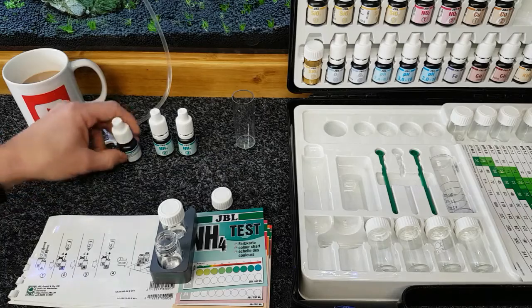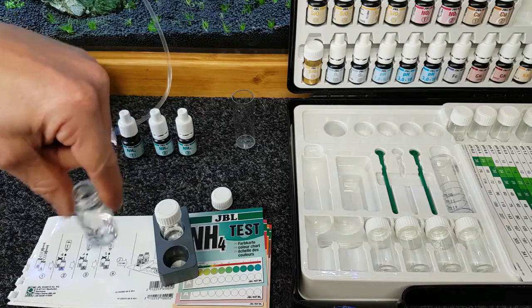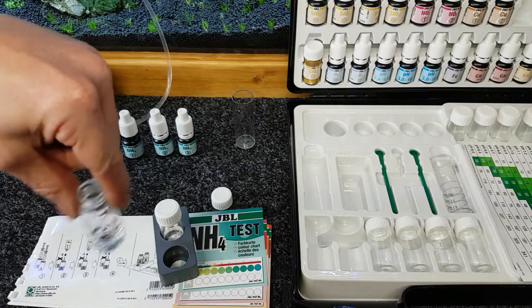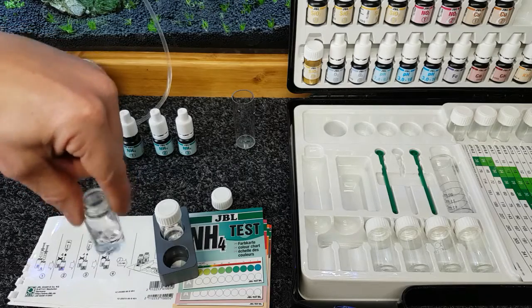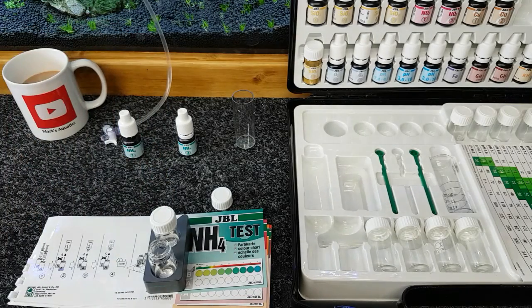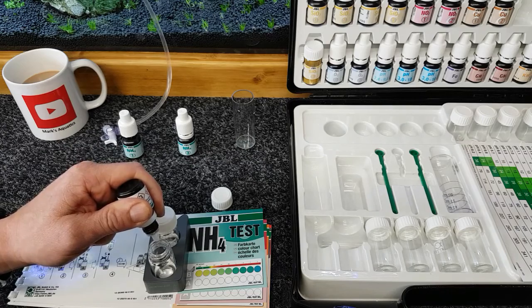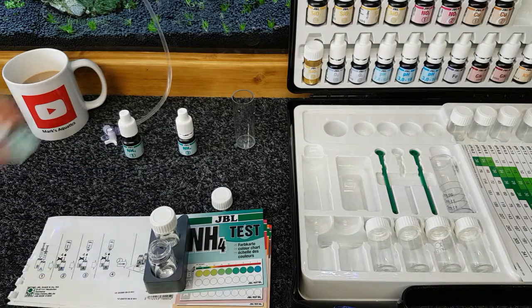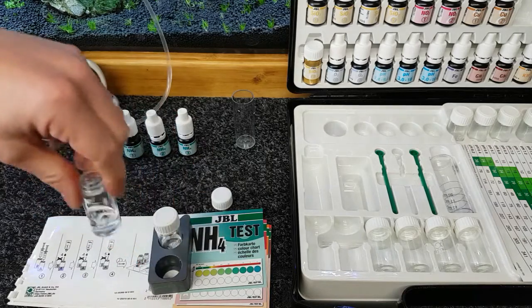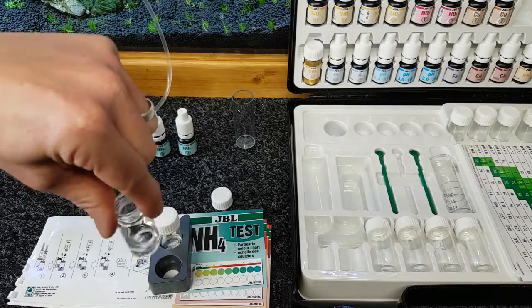Don't get this stuff on your hands, guys, okay? I'd wear gloves if you've got them. Then obviously you can take it out of there, give it a swirl around, and then pop it back in there. Now the same with the NH4 number 2. I've shaken these all up prior to doing this. So we want 4 drops of reagent 2 into there, lid back on, take that out, swirl it about, get that a good old mix up.